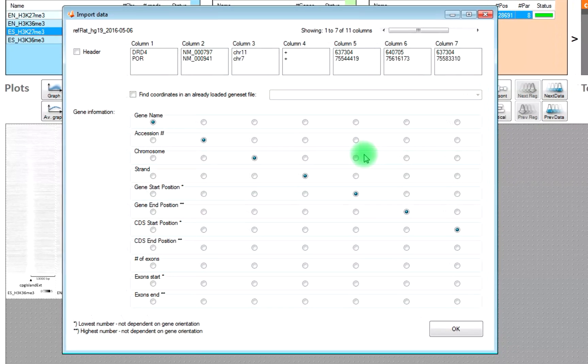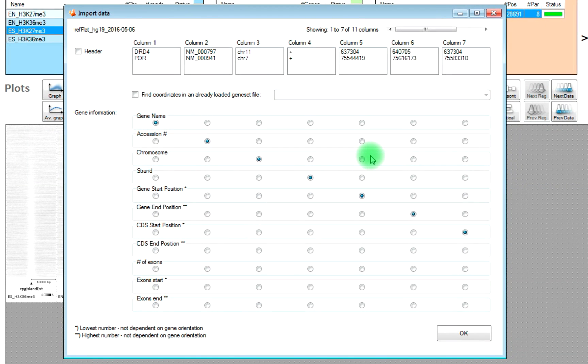And it is the one which corresponds to the data we have imported. Once it is downloaded, then we get this import wizard.